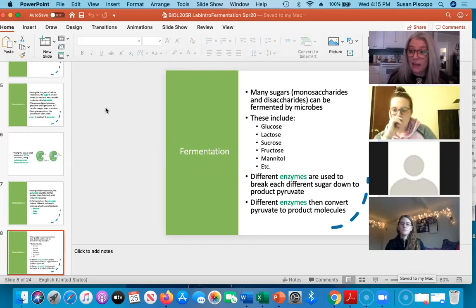If you recall, that's the one where E. coli gets selected, and we differentiate among the types of fermentation that E. coli can do. If the colonies grew green, we knew that the E. coli was fermenting lactose. And if the colonies grew purple, we knew that the E. coli was fermenting sucrose.